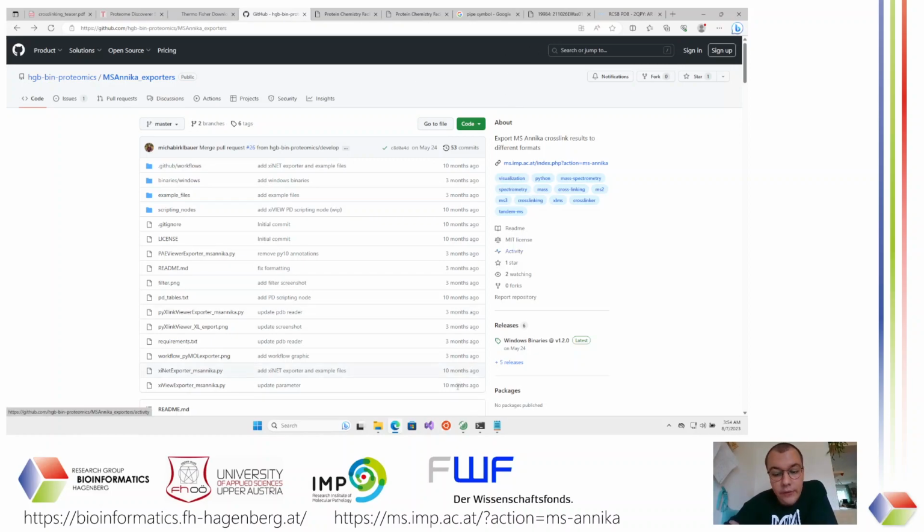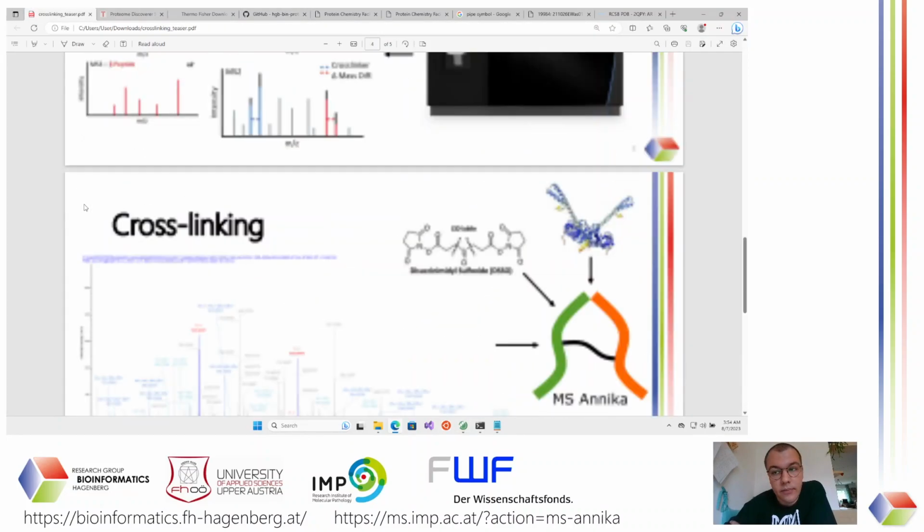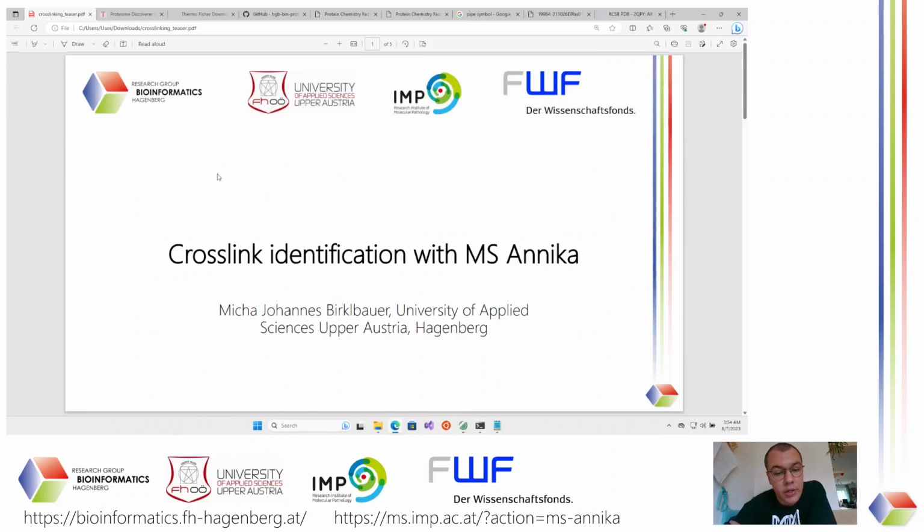So that's about it for MS Annika. I hope this was a helpful introduction to how to use MS Annika for cross-link identification. And we hope that you're considering MS Annika to use if you're doing cross-link identification. That's it for me.